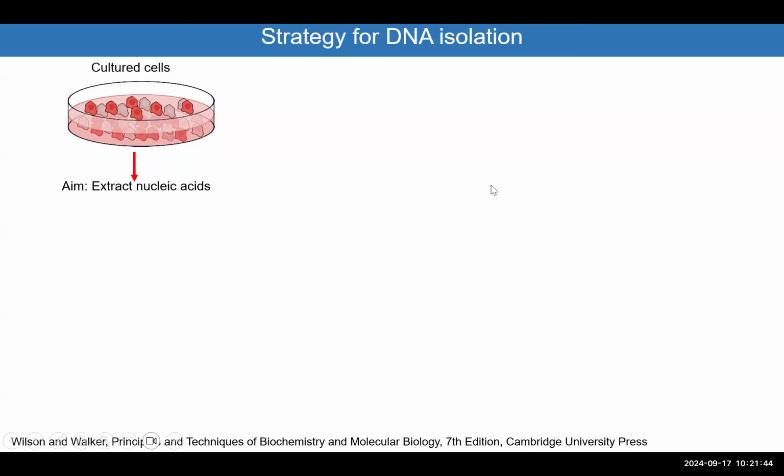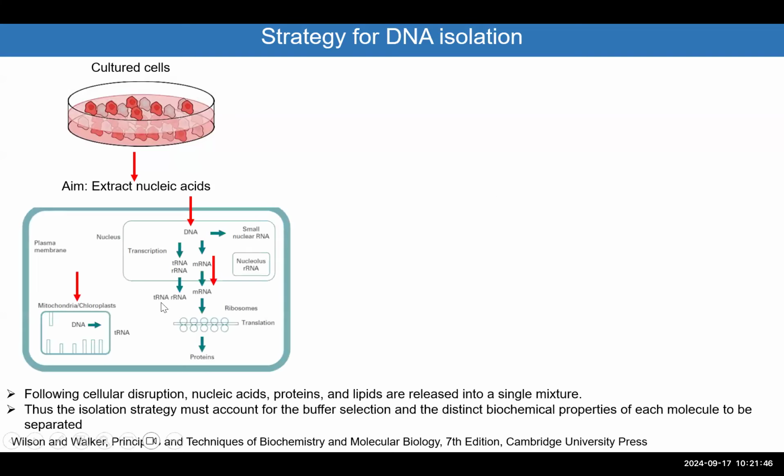So if we lyse the cells, and I think we are able to lyse the cells because that needs a lysis buffer and some sort of disruption that we discussed in the previous lecture on the fractionation process. But if you look at this cell, presented in a schema, it shows that if we lyse this cell, the nucleic acids are in compartments where RNA and DNA are together.